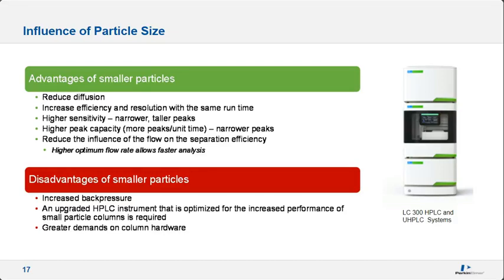There are some disadvantages of smaller particles, including increased back pressure, the need to have an upgraded or optimized HPLC platform in order to utilize the performance of the small particles, and finally, greater demands on column hardware.